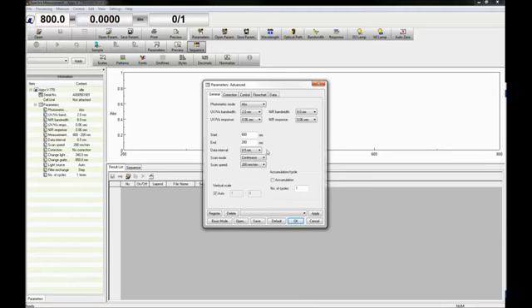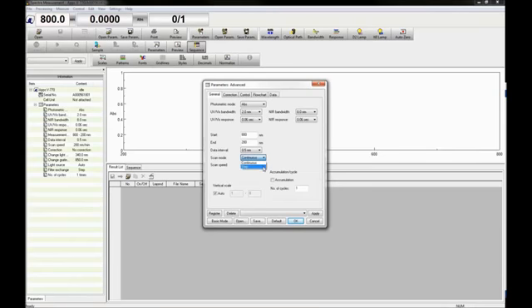There are two scan modes: continuous scan, which acquires a photometric signal at each wavelength while moving across the desired wavelength range, and step scan, which stops the monochrometer at each wavelength to obtain a signal.